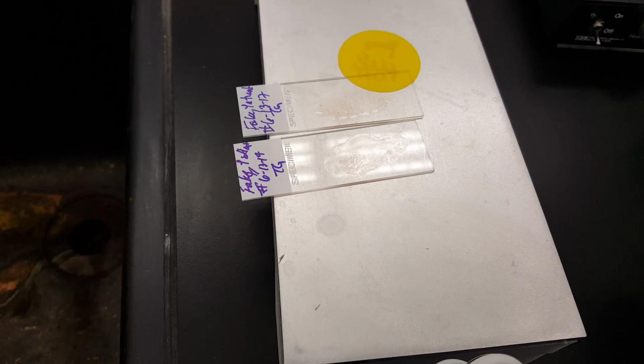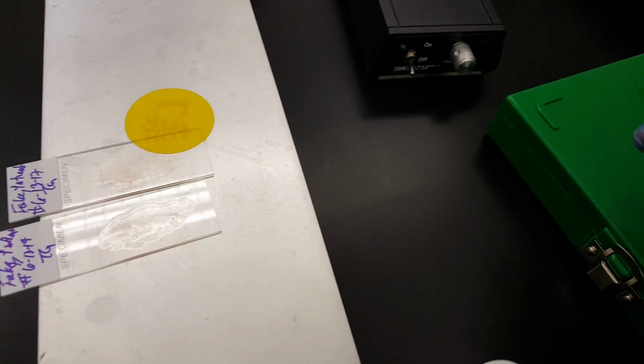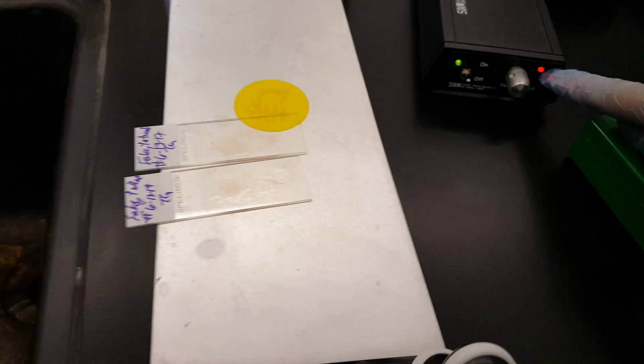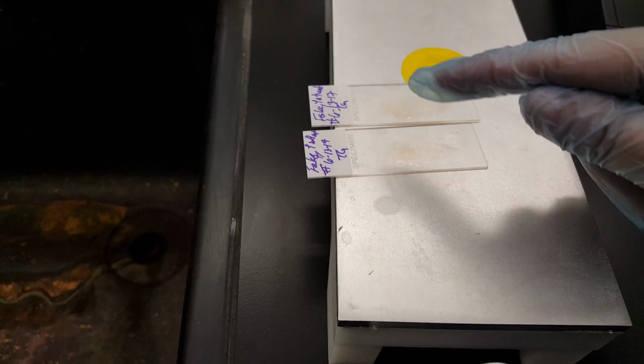So we put it on the drying rack or the drying plate, the heat block, and you want to make sure to turn it on so the green light is there. This is the control knob to control the heat. It does show that it's heating, and when it gets hot, this will say hot, and we'll let this dry, and then we would do a gram stain.